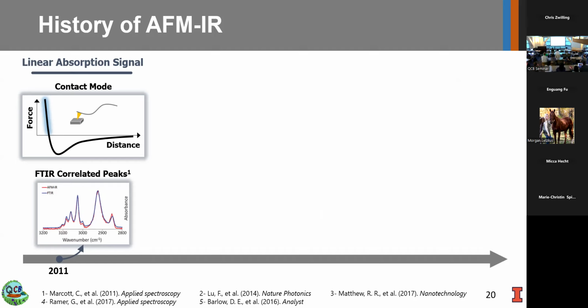So to actually achieve much higher lateral resolution, you typically need some method to isolate the surface measurement signal or basically section samples thin. But when you do that, you need much higher sensitivity because you're reducing the sampling volume.